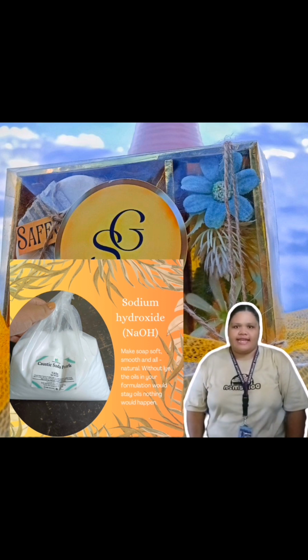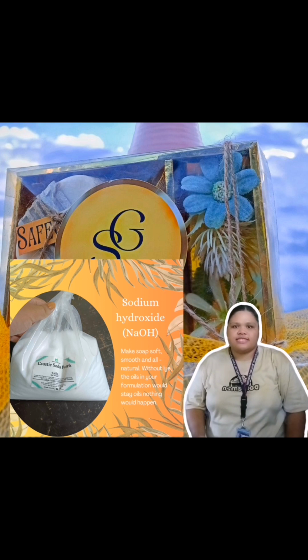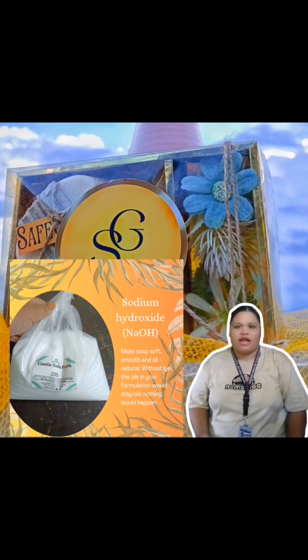Sodium hydroxide and potassium hydroxide, the two distinct alkaline chemicals, are referred to collectively as lye. They have a very high pH, making the mixture extremely caustic and capable of burning your skin if you aren't wearing gloves. Without lye, the oil in your formulation would stay oil. Nothing would happen to them.